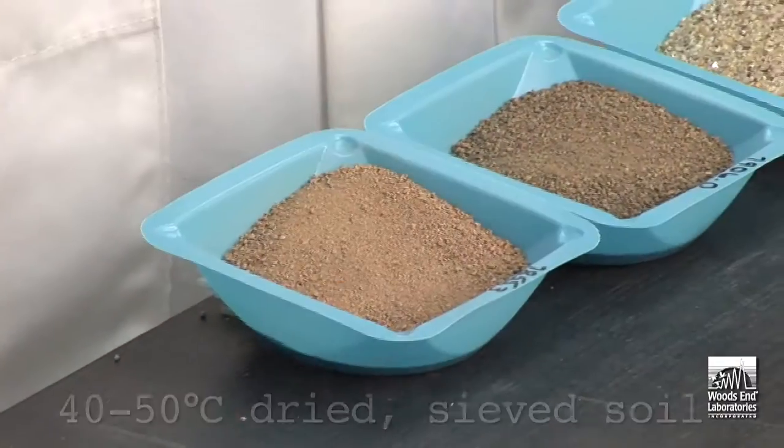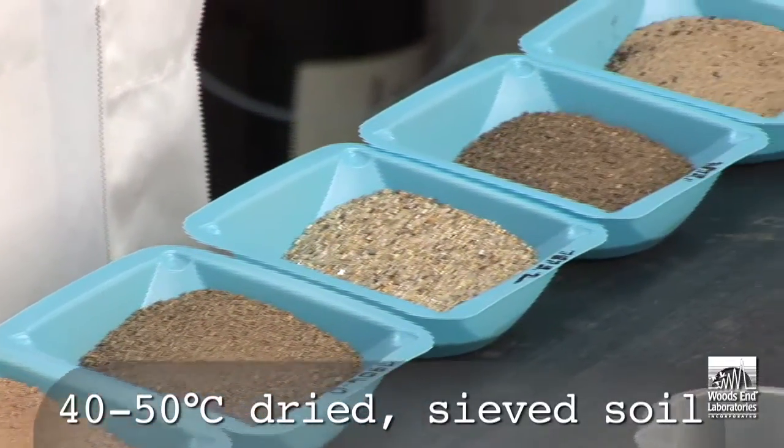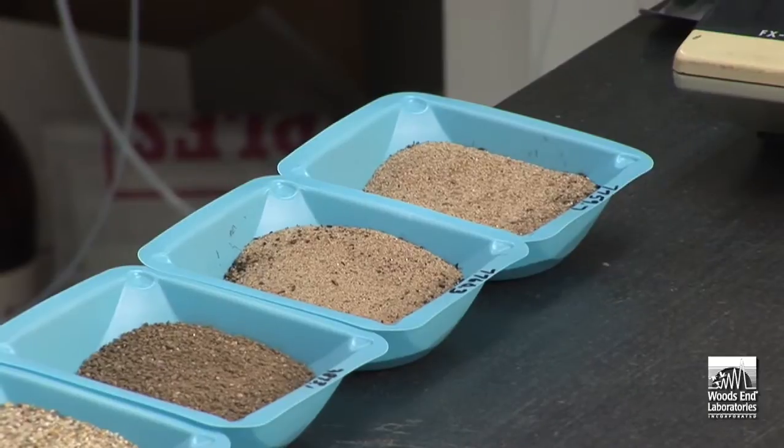Let's go to the lab and see how the Solvita soil test is carried out. We start with soil which has been previously dried at 40°C and then ground and sieved at 2 millimeters. This is an important part of the drying rewetting protocol that forms a basis for the test.